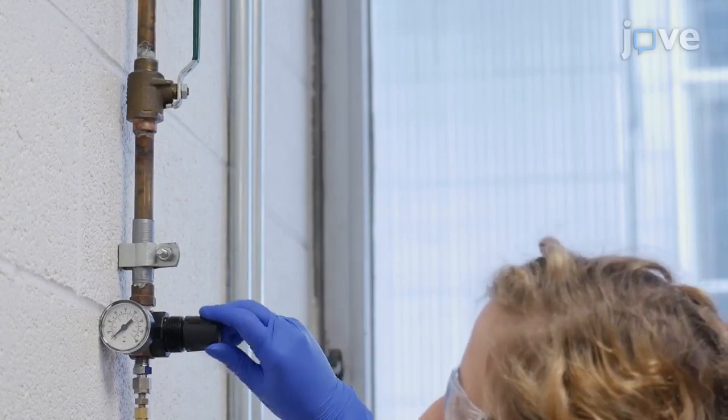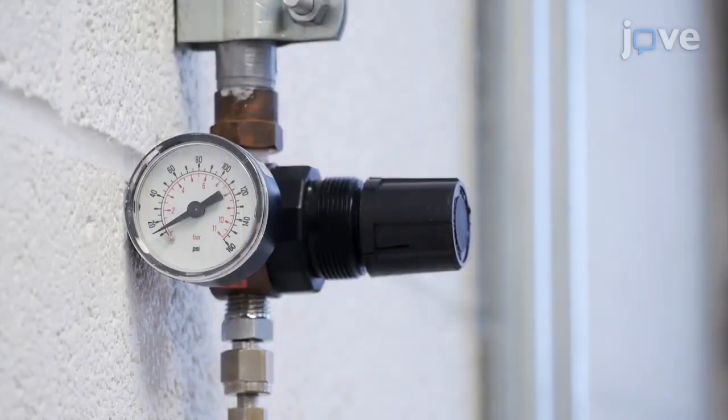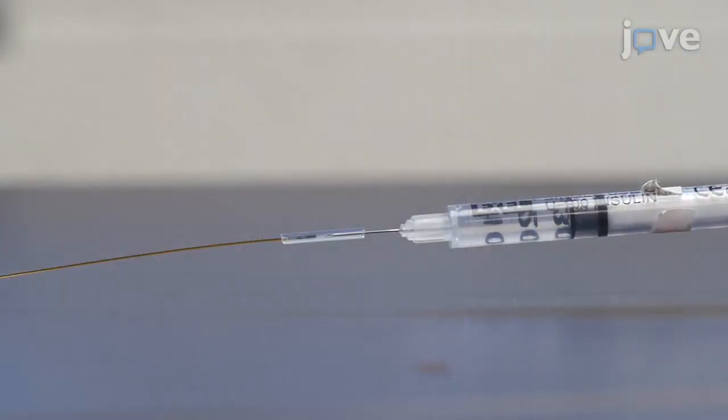To pre-treat the capillary, dry it with nitrogen gas at 10 psi for at least 12 hours. Then fill the capillary with 50% volume-by-volume 3-trimethoxycylilpropylmethacrylate in methanol using a syringe pump.